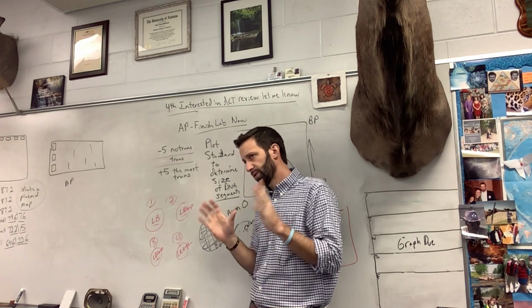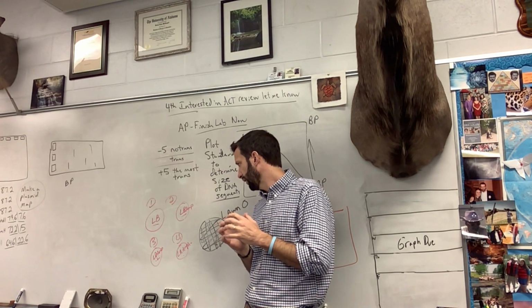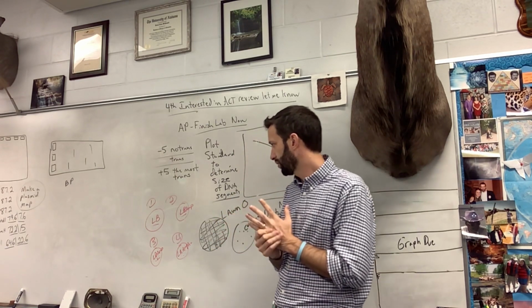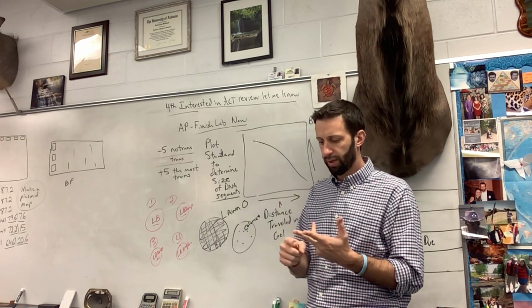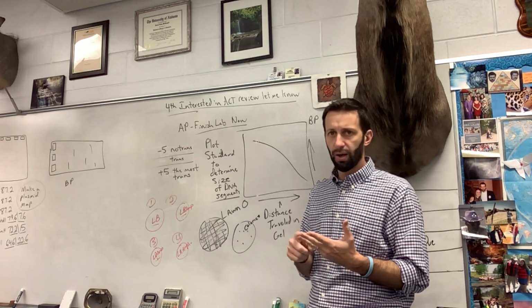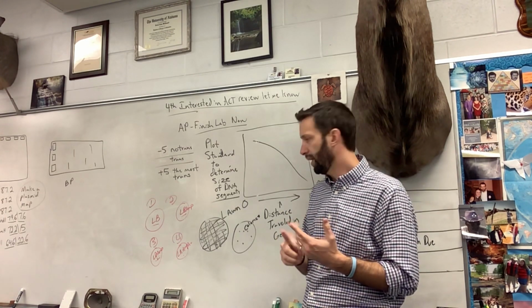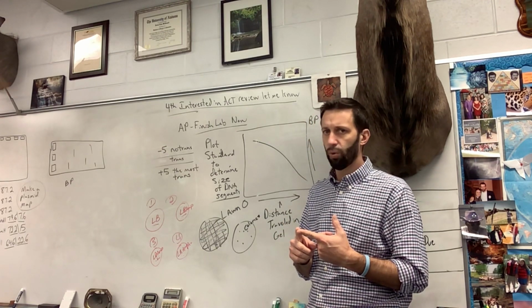No, but like I said, you need to focus on what you had. Number 2, with the LB and the AMP and negative, what's in that petri dish? You have the broth to grow bacteria. You've got AMP, which is ampicillin, an antibiotic. Antibiotics kill bacteria, and you've got negative, which means what? No plasmid.